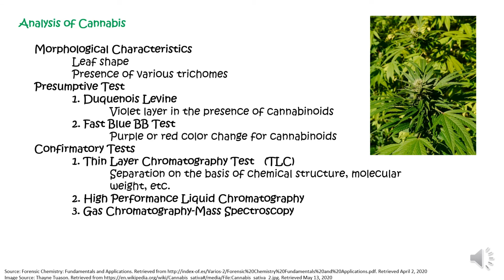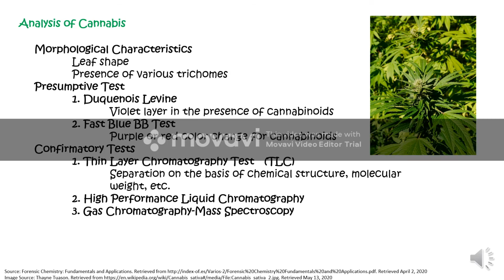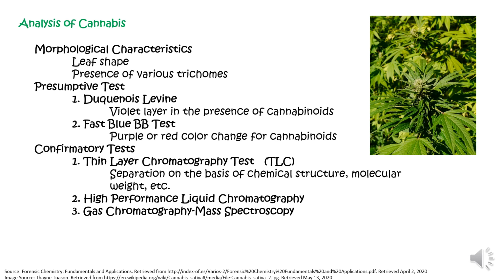After shaking and mixing, drops of concentrated hydrochloric acid will be added. So you need to do the final shaking and observe the color change after the addition of hydrochloric acid. Any color that results after the addition of HCl, or hydrochloric acid, should be recorded.